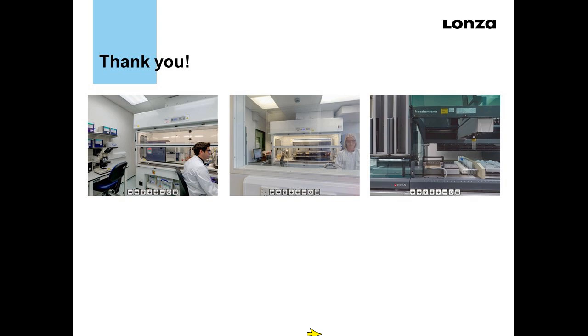the enzyme PNGase F has been available for a while, which allows glycans to be cleaved quite cleanly so they can be 2AB labeled with a fluorophore, because glycans themselves won't be detectable using a fluorescence method. So you really want that fluorophore to boost that signal. But if you have O-linked glycans, there aren't actually any commercially available enzymes that can cleanly cleave off the O-linked glycan. There are some alternatives, but I won't go into these so that we stay on topic.